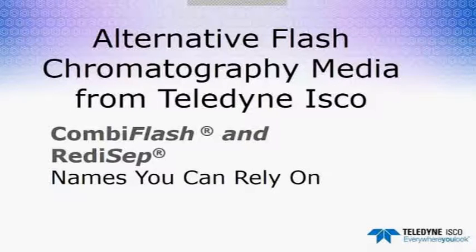Good morning. Today we're going to talk about alternative flash chromatography media. These are chromatography media that are other than silica gel, although we will discuss new and different ways of using silica gel. We will also discuss C18, although that's not really considered an alternative media. We will discuss different ways of using C18 to expand your chromatography repertoire.